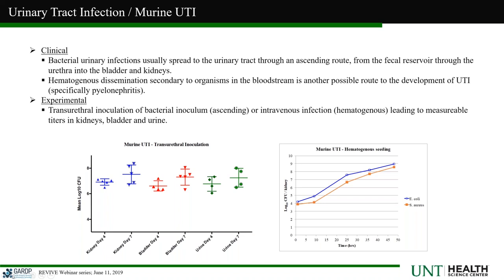And we have a day 4 number there because that is how long we wait before we start treatment in the model, because we were waiting for this model to develop to an actual condition. When you're presenting clinically with a UTI, you're presenting when you have symptoms and you have pain. So we want this model to establish.